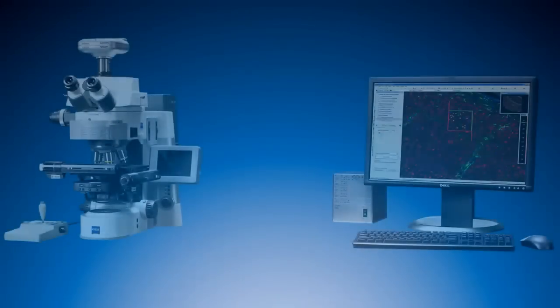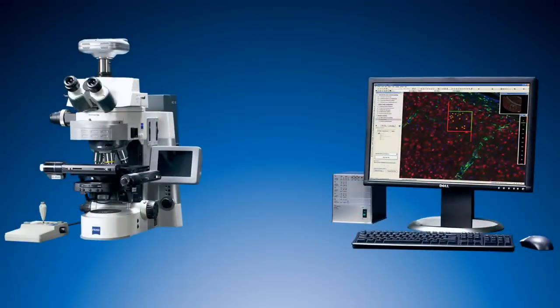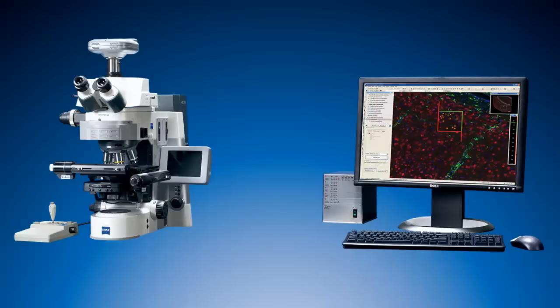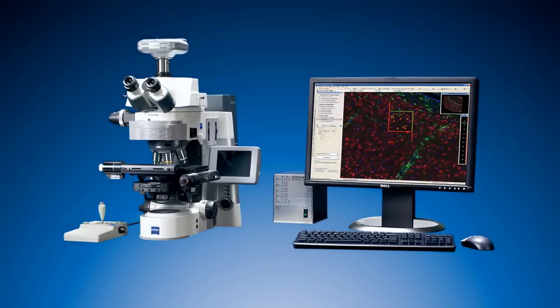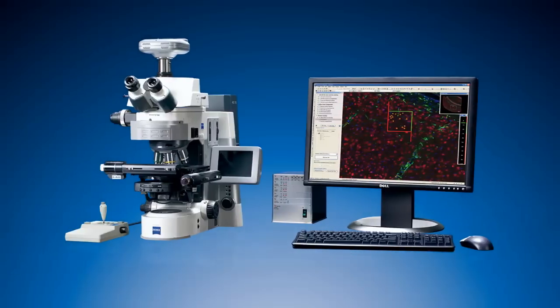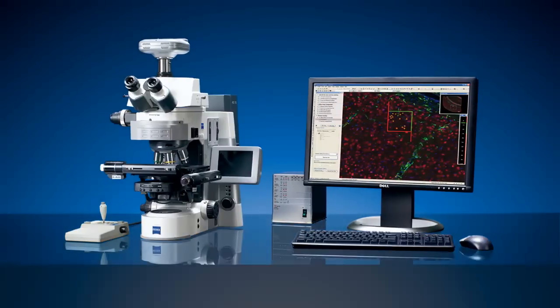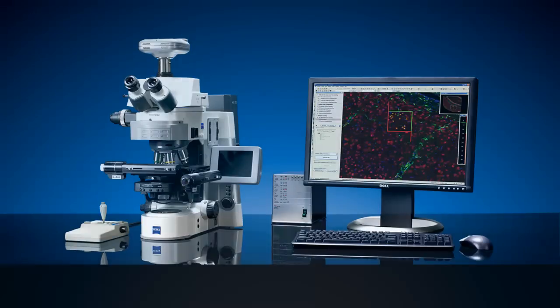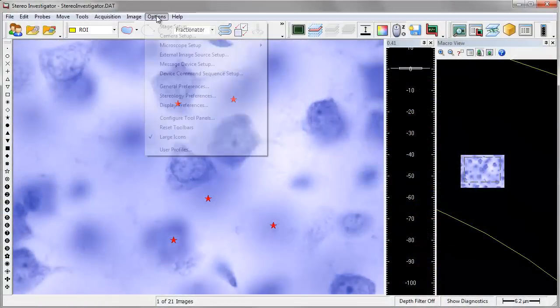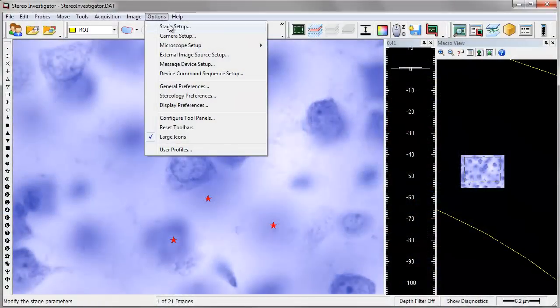StereoInvestigator can literally drive dozens of combinations of microscopes, stages, or cameras. StereoInvestigator has been specially built to control these parts of your microscope system to automate numerous functions that you would otherwise need to perform manually with other stereological packages.